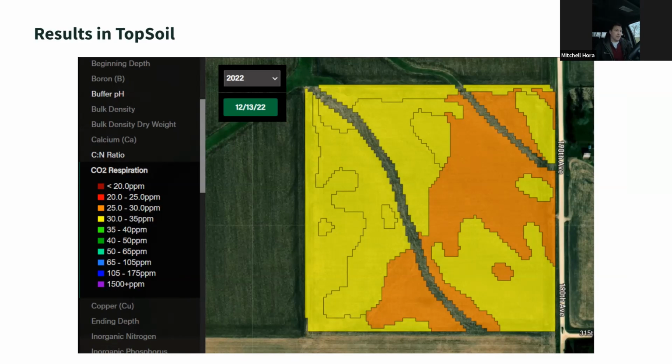And we've done thousands and thousands and thousands of these Haney tests now that you're able to benchmark yourself against, so that you're not just comparing 2 samples, but you're able to learn from all the work that we've been doing since 2015 on this test. So really trying to get you as much value as we can. But again, we'll dig into that next time. The key thing here, just keep in mind what is going to provide a good side-by-side comparison when we go back and look at the results.